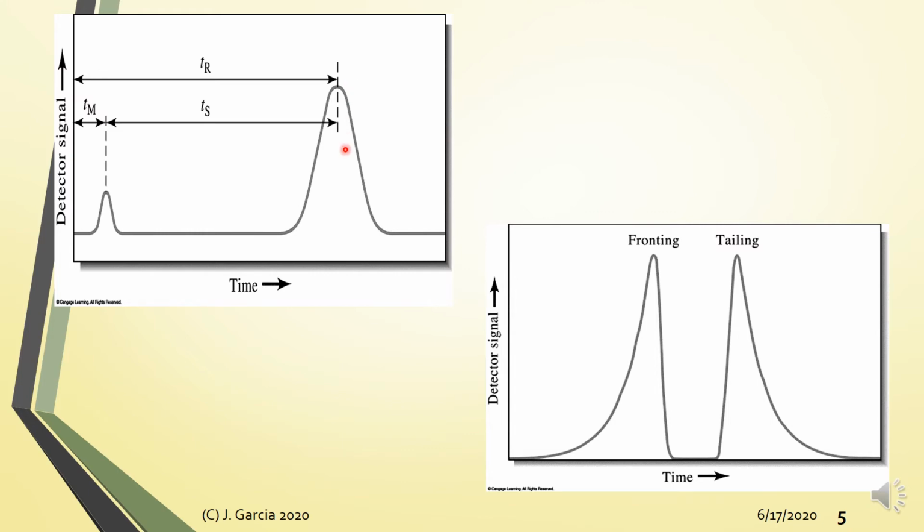It shows you the actual time that this solute spent inside your stationary phase. Okay? Now, ideally, your peak should be Gaussian in appearance or normally distributed.